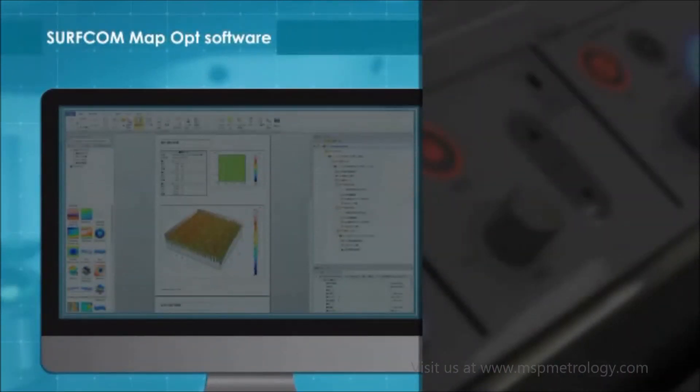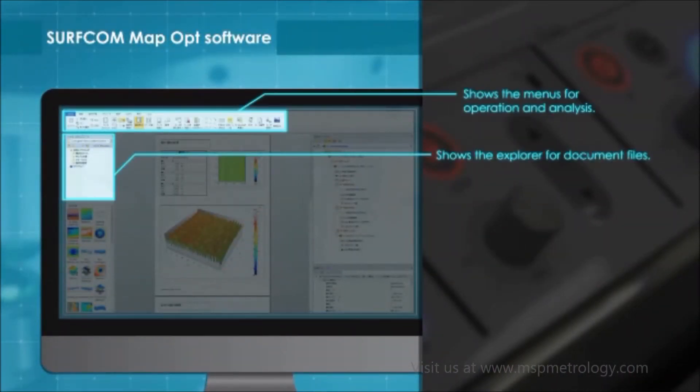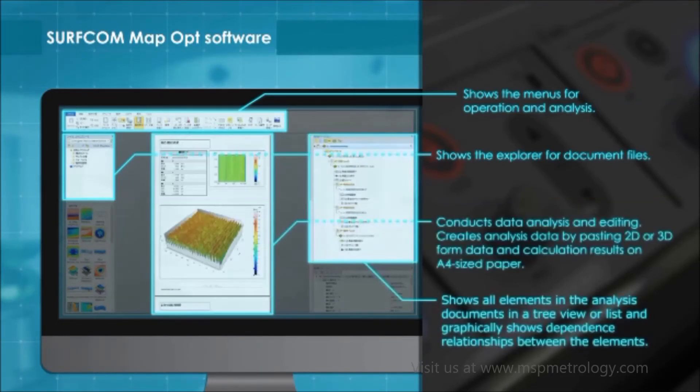Its analytical software, Surfcom Map-Op, allows you to analyze measured 3D surface texture data. Analyzed data can be saved as a document file so that it can be retrieved at any time for re-analysis. The screen structure is easy to see and is used for various 3D analyses.